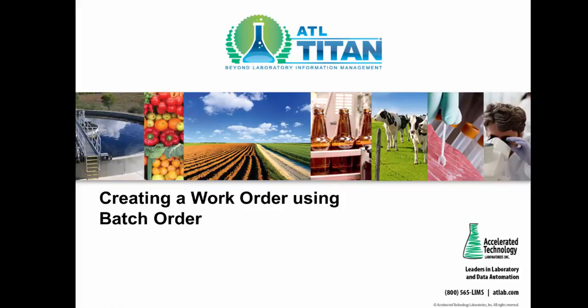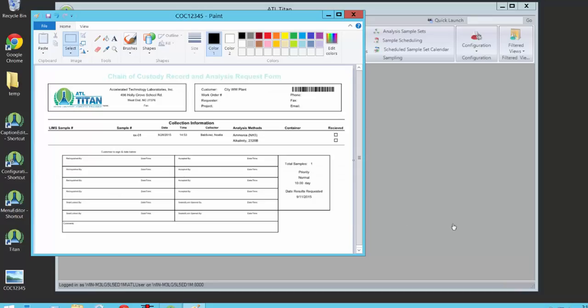Let's create a simple work order using the batch order function. For this example, here's our chain of custody. It's from the city wastewater plant. They've included the sample name, the date and time it was collected, who collected it, and the analysis methods they're looking for. The priority is normal, so they're just looking for our standard 10-day turnaround.